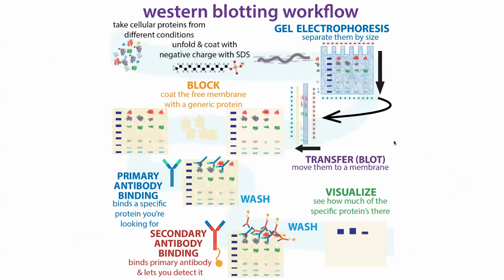With the Western blot, basically what you're doing is taking those proteins and separating them by SDS-PAGE, which is a technique where you denature, so you unfold, the proteins, and send them traveling through a gel using electricity. The proteins separate based on their size, because the longer proteins get tangled up more in the gel mesh, and so they travel slower. When you turn off the electricity, they're stuck in place in the gel, and the bigger proteins won't have moved as far. You can then take all of those proteins and transfer, or blot, them onto a membrane.